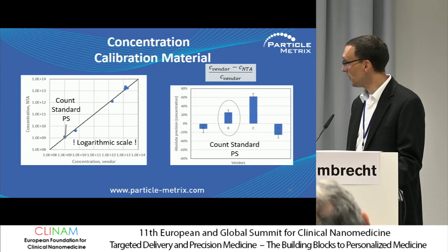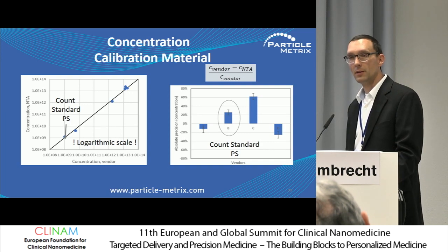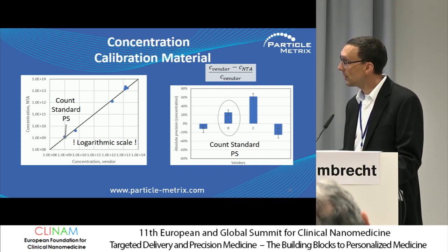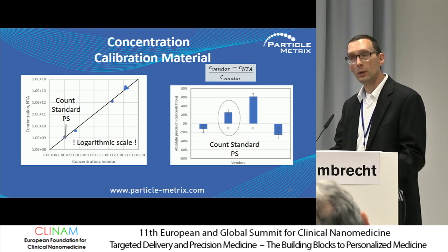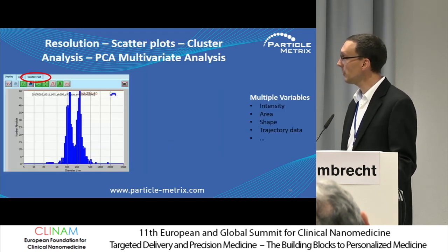and we were very amazed. There were variations up to 60%, and this is also a question to the vendors for those calibration materials, and so we have to talk. Why is this happening, and how can we make products better? So we need both the standard and the instrumentation.